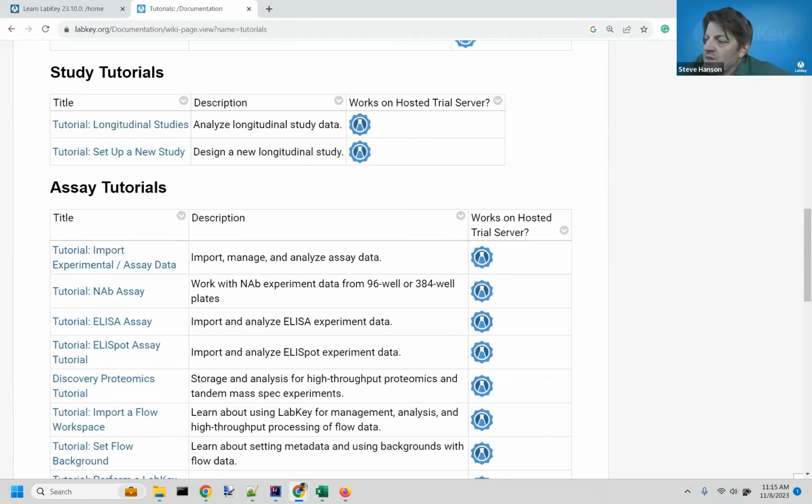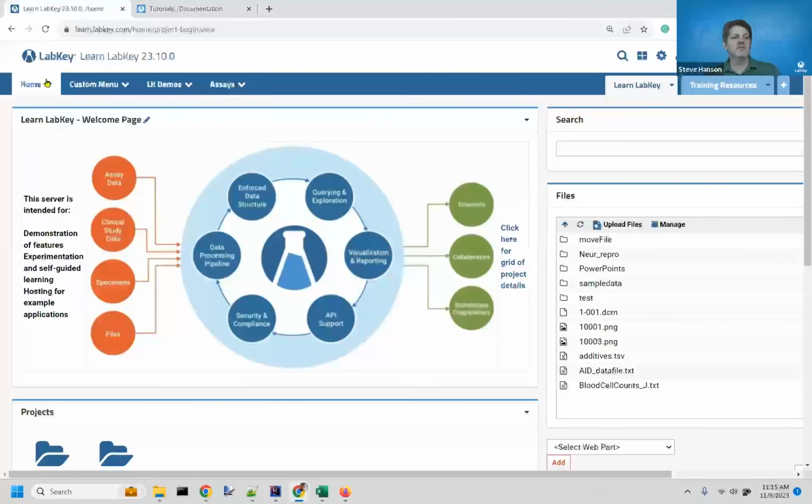And the user now says some more detail here. So I have freezer samples in one table and assays in another table. Absolutely yes. So the answer is absolutely yes. You could do this with a query. You know what's the best way to do it though? Is with a lookup. And now that you're here, and now that we just did a thing on the grids, let's just see what a lookup can do.